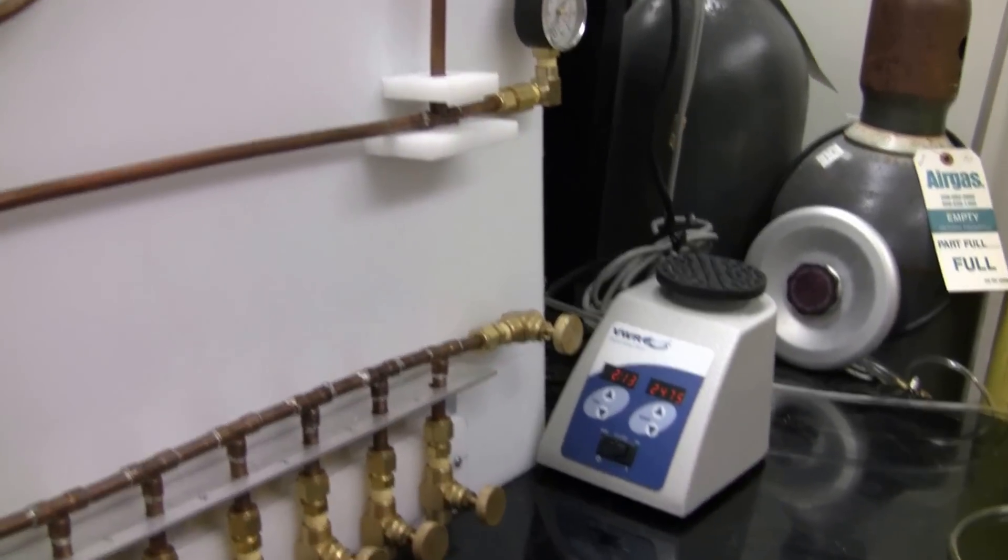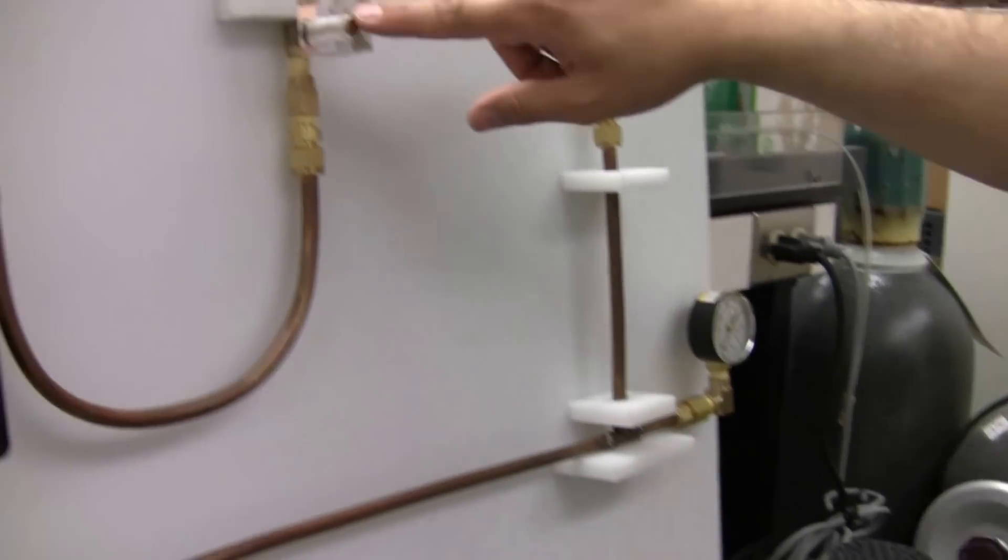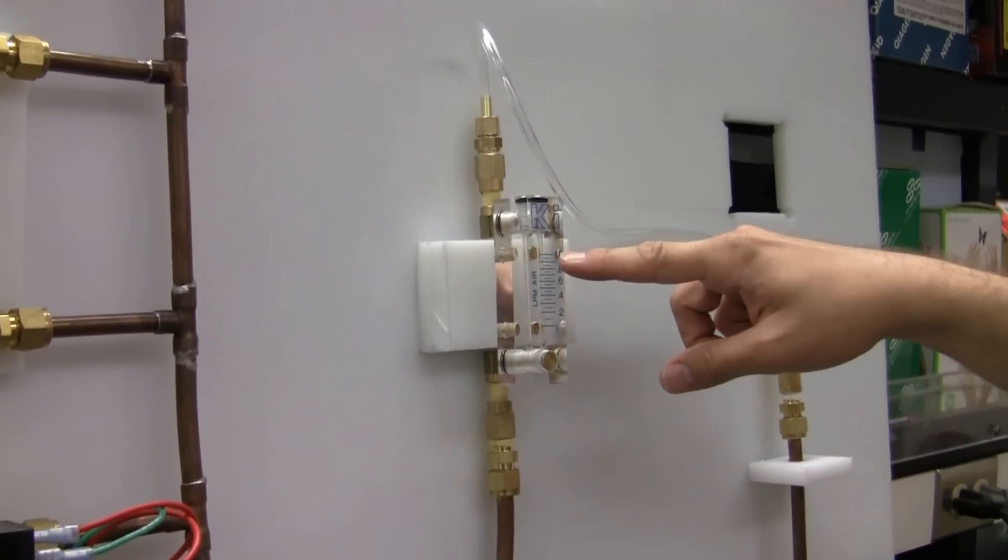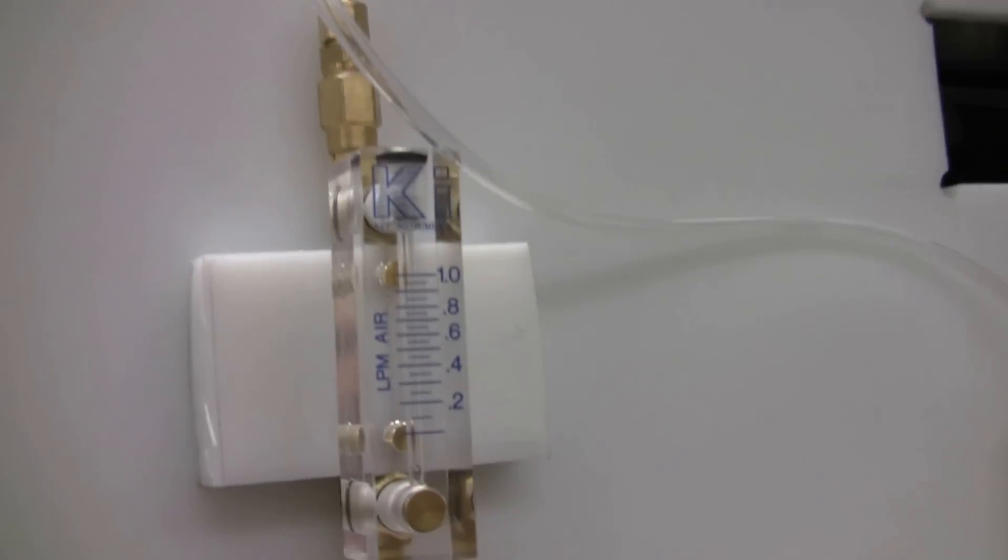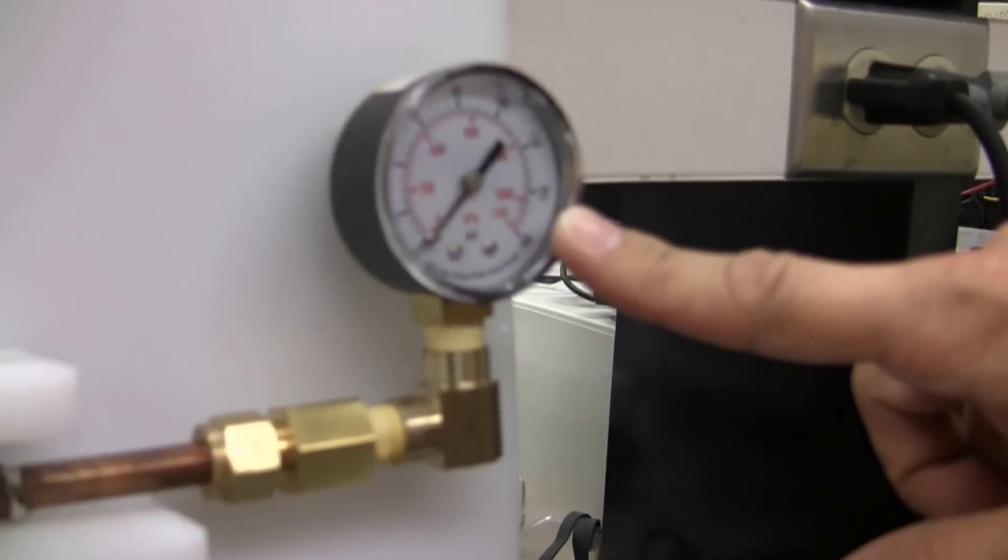In addition, the manifold has a flow meter up to one liter per minute. It has a manometer that measures the pressure in the destination.